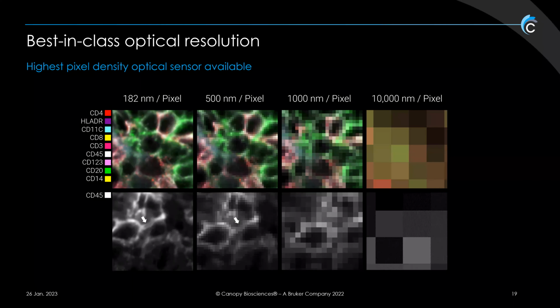What we found out though is that in our analysis, we didn't compensate for the fact that now we can get a much more exquisite border around that particular cell. And because of that, we were actually cutting off the signal that was being averaged by the older algorithm just because it was taking bigger pixels. So we compensated for it. But what it does prove is that you absolutely can get better segmentation with higher spatial acuity collection. This will empower new science.